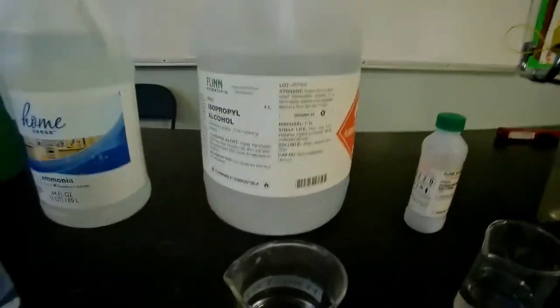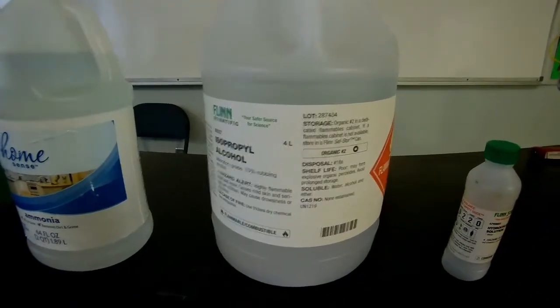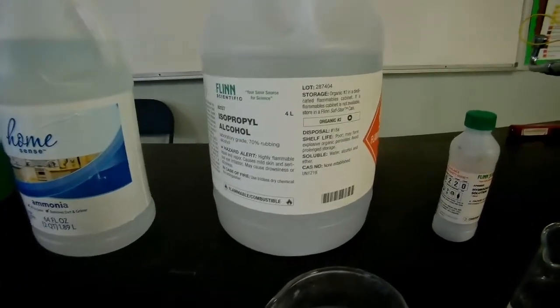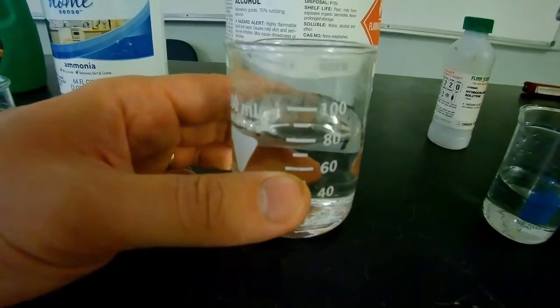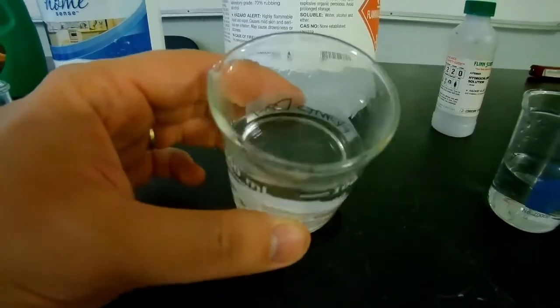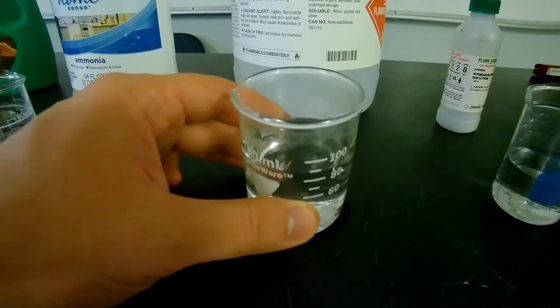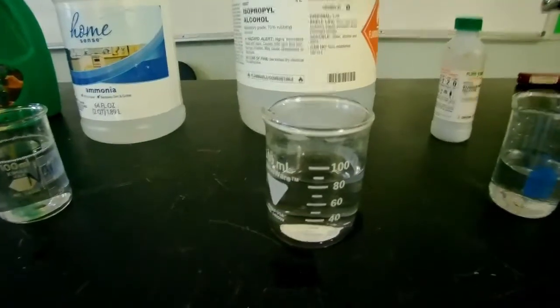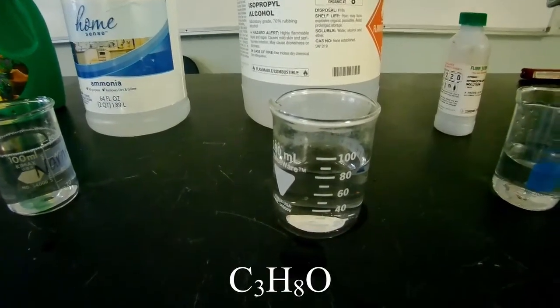All right, our next contender is going to be rubbing alcohol. That's the one I lit on fire yesterday, or the other day. So this is isopropyl alcohol. I think we've probably all seen alcohol before. It smells like alcohol. I'm not going to smell it. I think you guys know the burning sensation you get from smelling alcohol. It's a clear substance, and the chemical formula for this one is C3H8O.